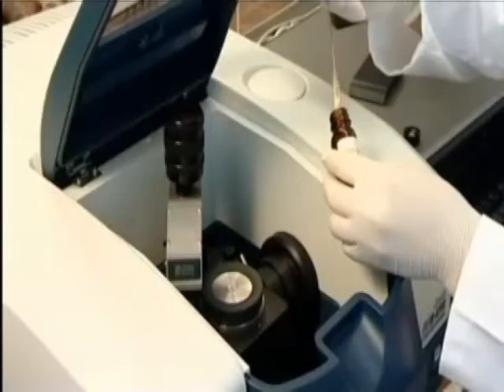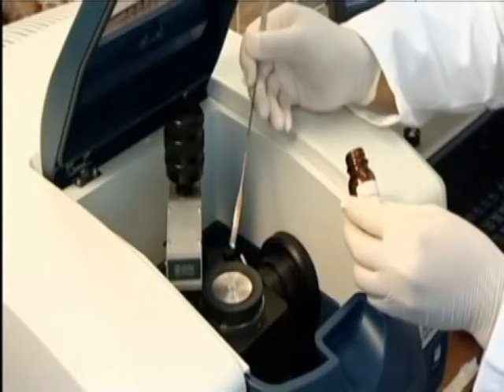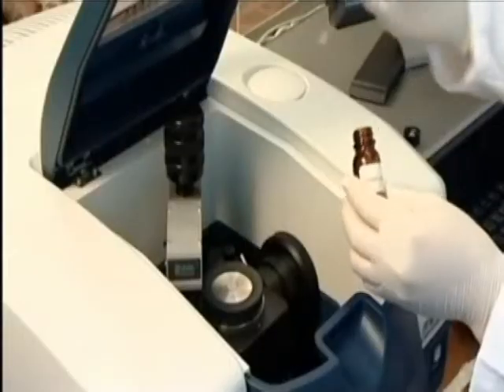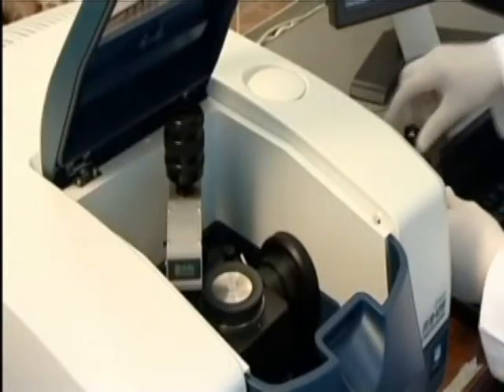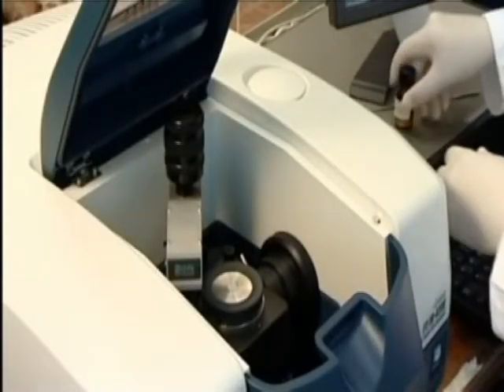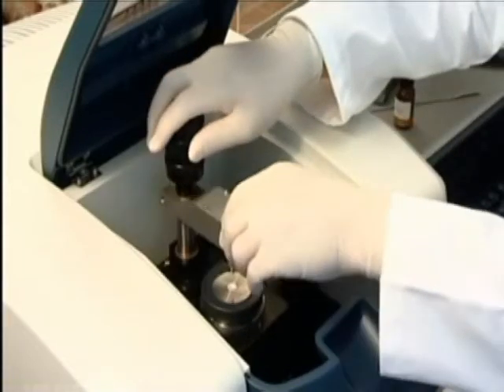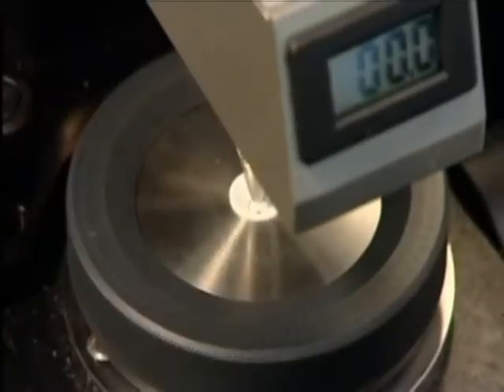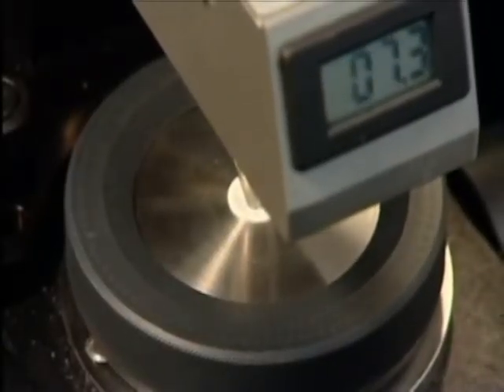A little benzoic acid is placed on the ATR crystal. This is a holder for solid samples. Less than 1 milligram of solid sample is required. The torque wrench is used to squash the sample to ensure a good contact with the surface of the crystal. For most samples, no preparation is required.